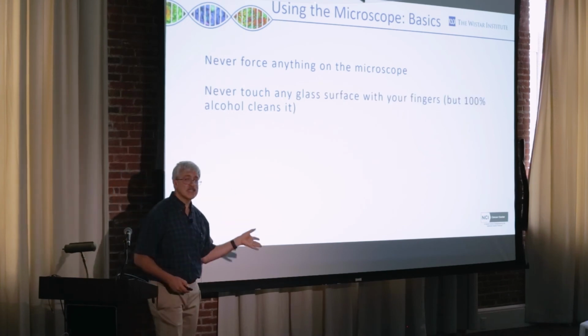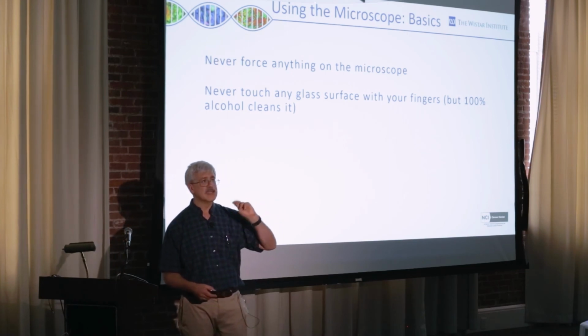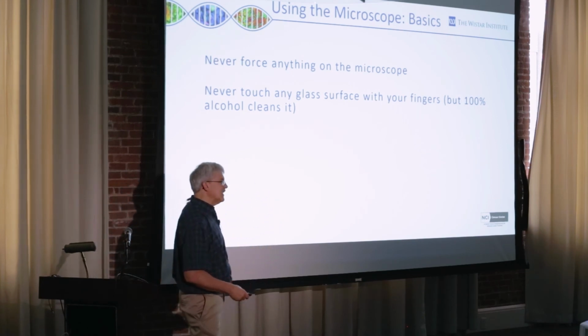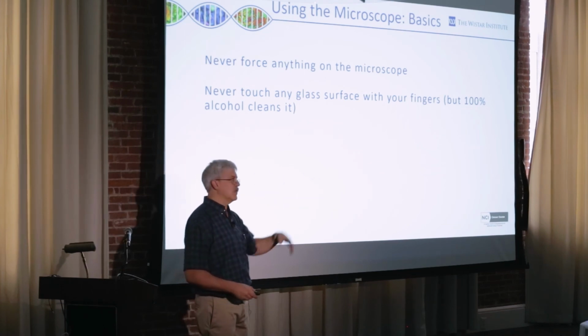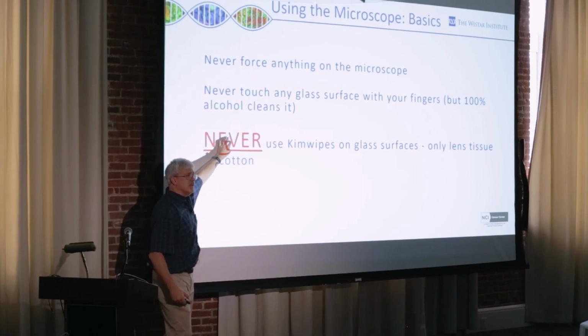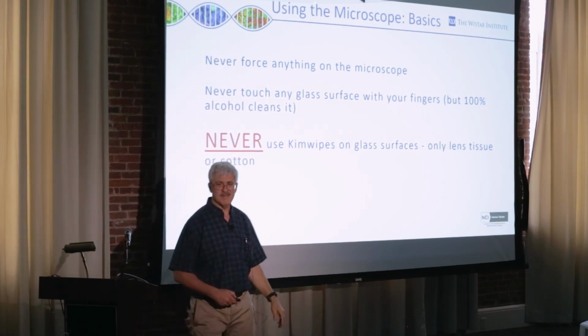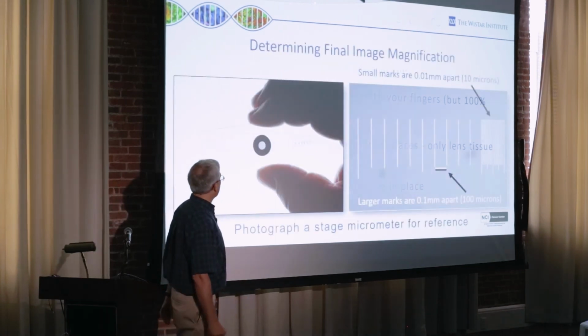Never touch any glass surfaces with your fingers, right? You really don't want to be looking through dirty fingerprints. But ethanol does clean that off. But again, I don't want you guys cleaning it. If you do find fingerprints, let us know. We'll clean it. Never, never use Kimwipes. All right? And always start with the 10x. I beat that one to death.